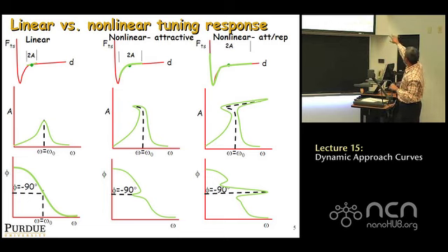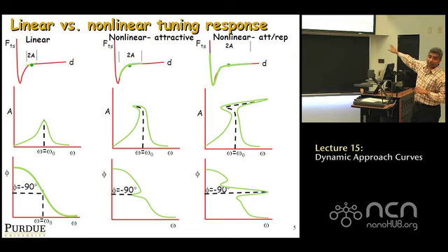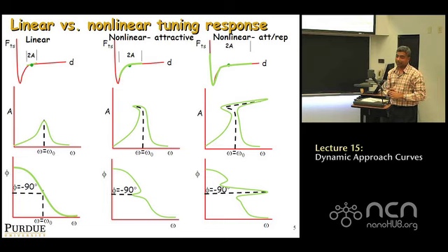And the phase, again, gets really distorted in an interesting way, but what still remains true is that the 90-degree point, phase equal to 90-degree point, corresponds to the apex of the resonance always. So the resonance curve can move this way, it can bend both ways, but the tip is where the phase is 90 degrees. Okay? This is what simulations will show you and experiments will show you. Okay? Any questions on this? But now we're going to see why this happens.